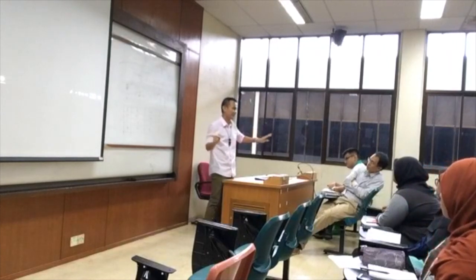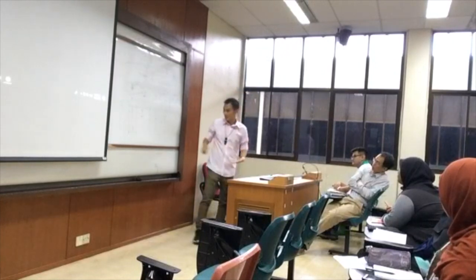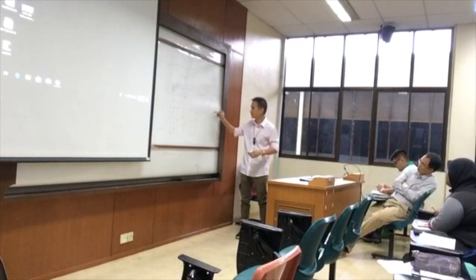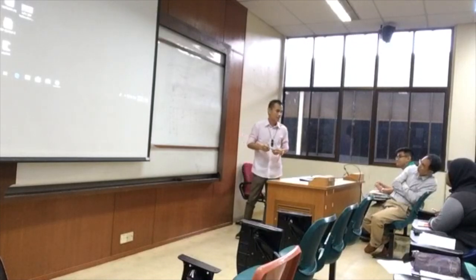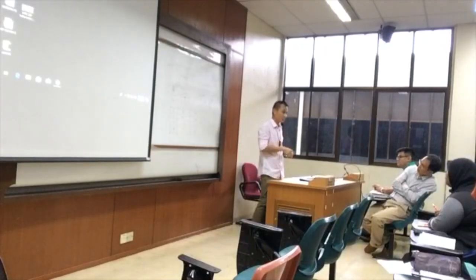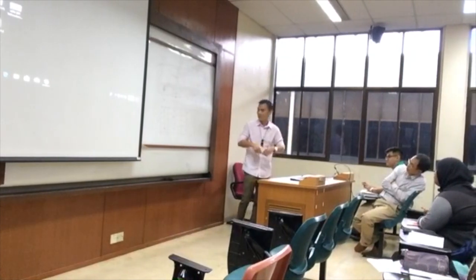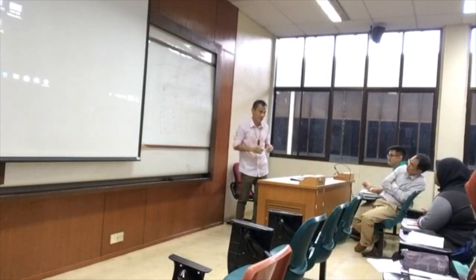But you know the ladder that we have in the gel electrophoresis just now, the one in the ladder I told you about, like here. This is known DNA so that you can compare with the samples, and this was prepared using restriction enzyme. But we buy it, we don't do it ourselves, we just buy the standard ladder. They use restriction enzyme to cut the DNA so that in the mixture they know this is 100 base pairs, this is 200. So you can compare your samples with this one, but we're not going to do restriction enzyme at all.